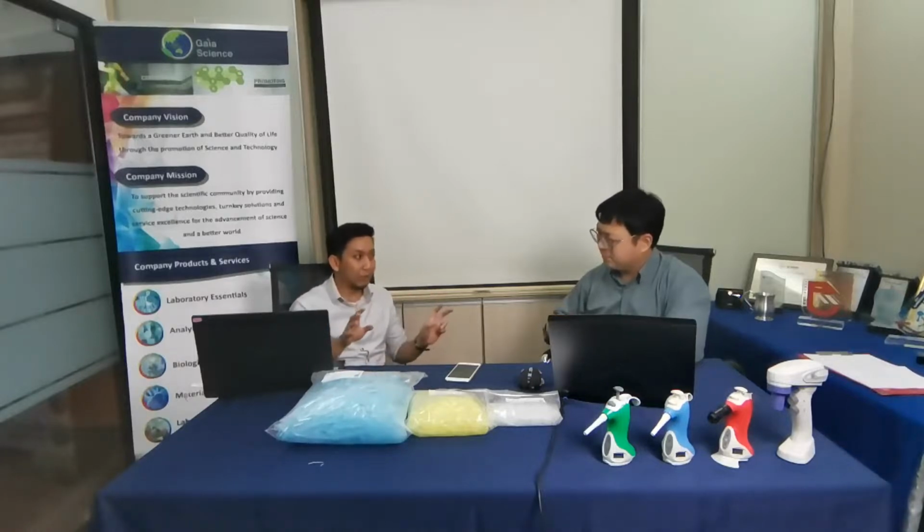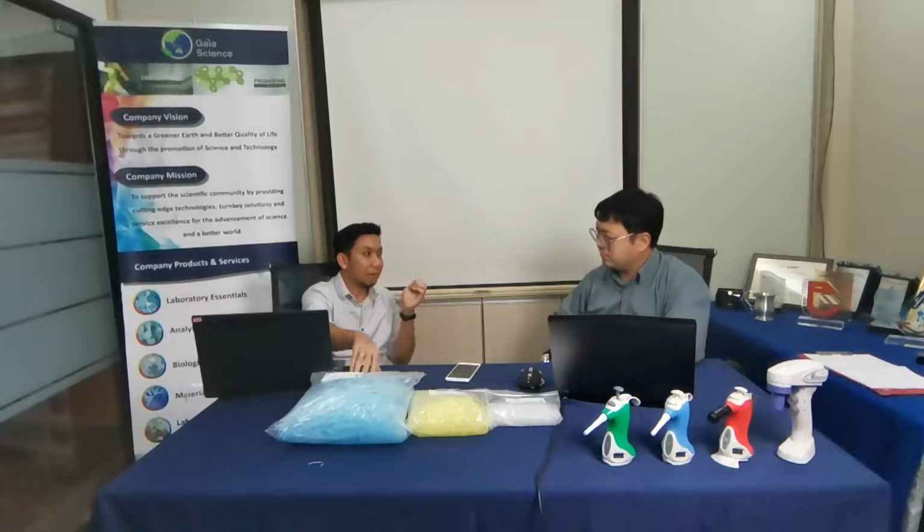No, there is more to that. We're not just talking about biological contamination here. We're talking about the RNases, and then we're also talking about the pyrogen and endotoxin contamination there. This is something that we are always trying to avoid, particularly if you're working with a molecular or human or live sample. That's right. You don't want this to interrupt your result, because you might think you save more money, but actually you will end up spending more because you need to troubleshoot or redo all that.